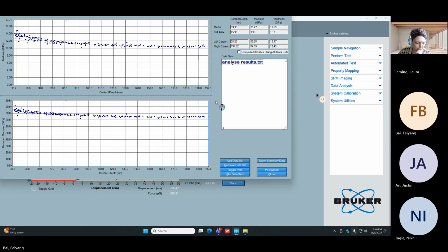Okay. So what this has just done is it's opened each file, clicked execute fit, and it's gotten hardness and modulus results. Here's my question to you. Do I care about if these results are good or not right now? Or better question might be, do you expect them to be good at this point?